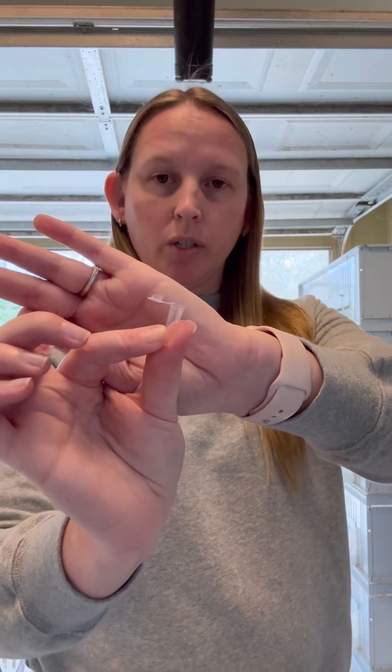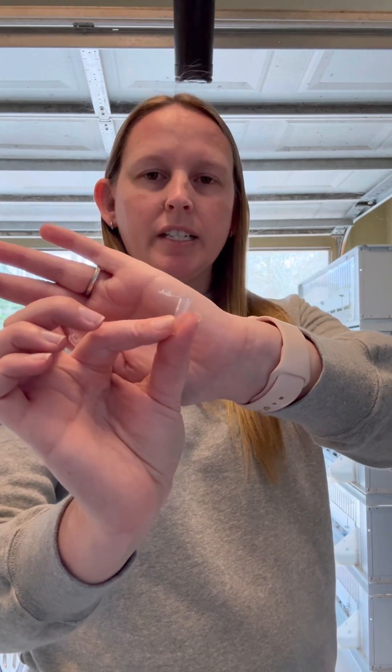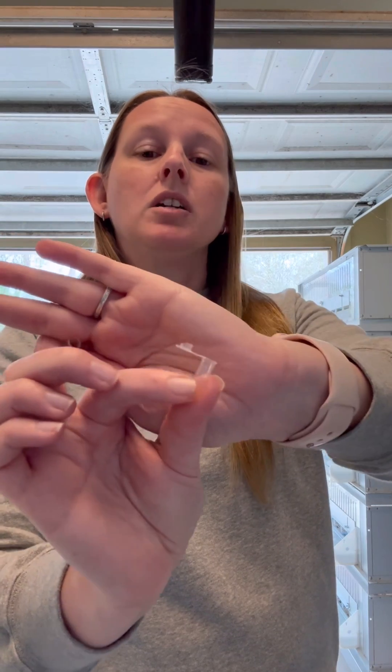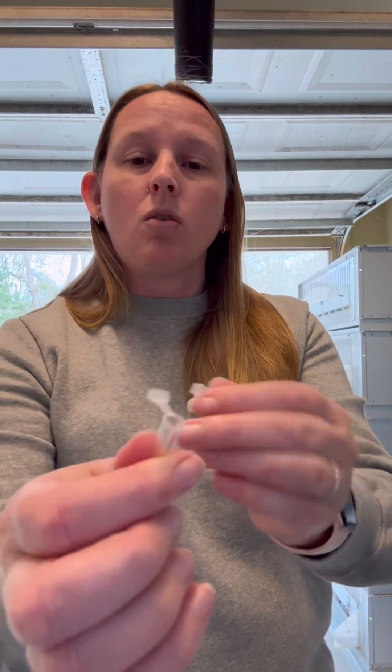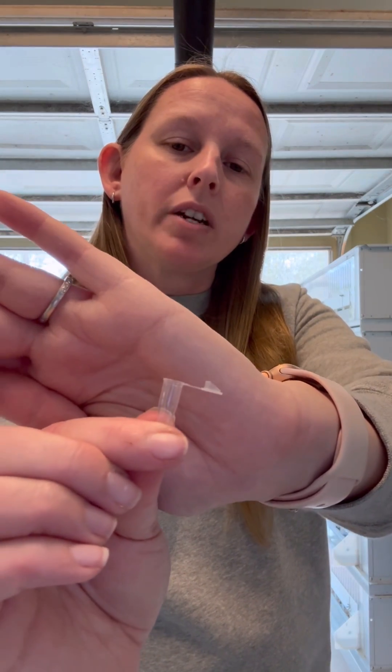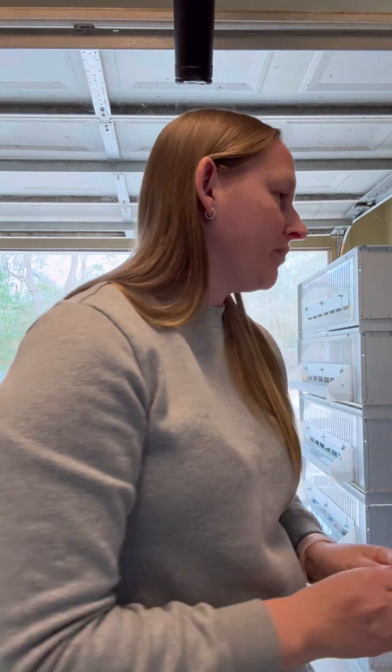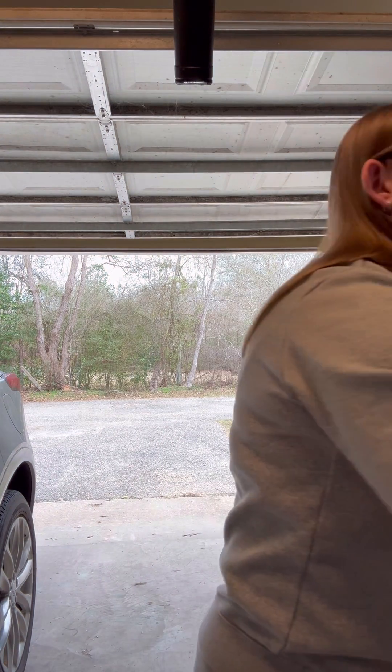Alright, so let's go over the supplies you're going to need. You're going to need PCR tubes — don't worry, I'll go over where to get these, it's super easy, and if you don't want to get them off Amazon then I can send you some, just reach out. You're going to need a PCR tube for every sample. You're also going to need little baggies to put your sample in.